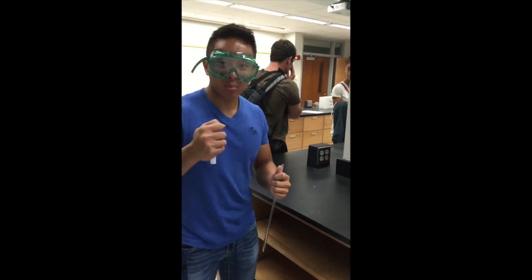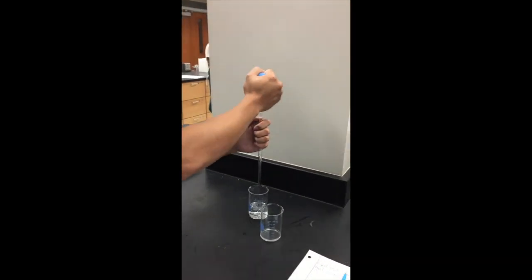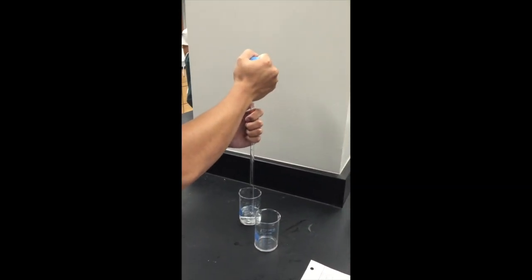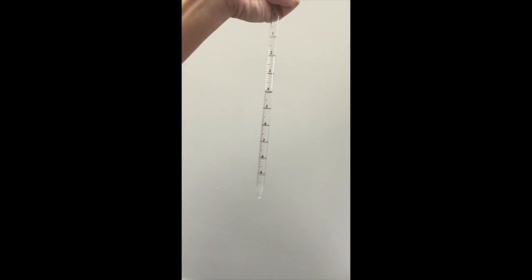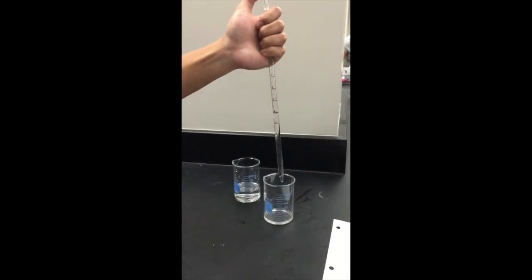milliliters. Now we're going to take our bulb and our pipette and pull up some water to find our initial volume. From this reading, we can see that it's around 4.01. Now we're going to empty our water to find what our final volume is.